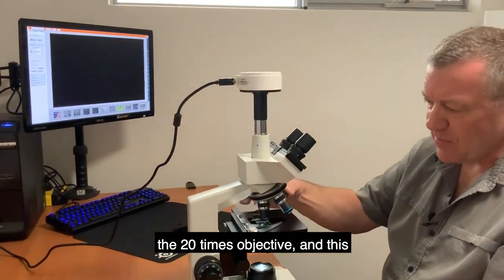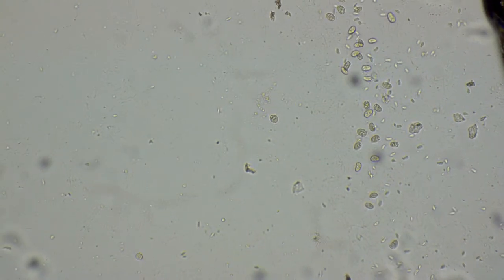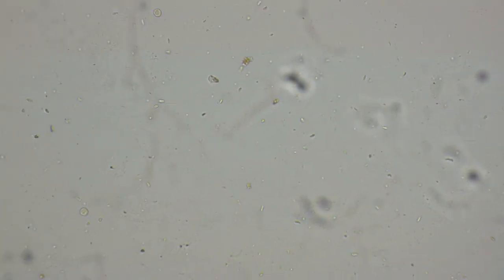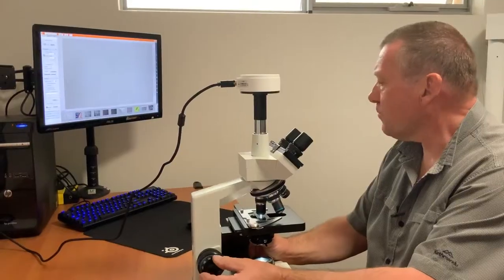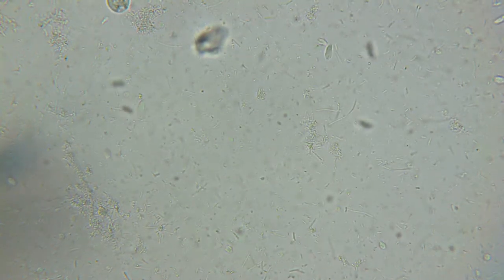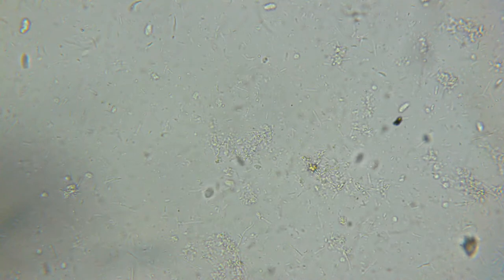I'm switching to the 20x objective, which gives you 200x magnification. With this camera you can capture still images and also record video straight to the computer. Now switching to the 40x objective for 400x magnification.